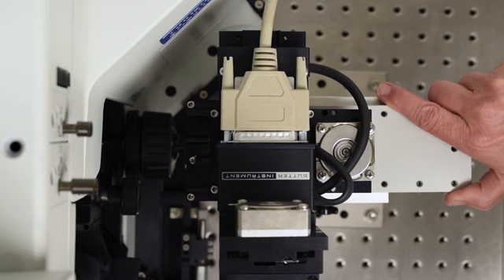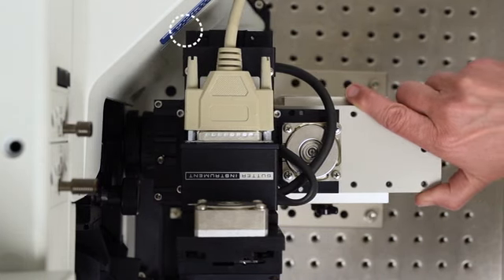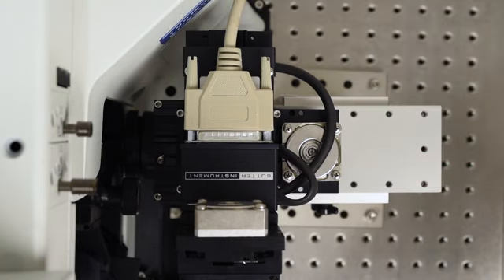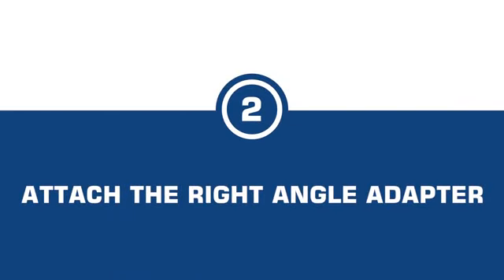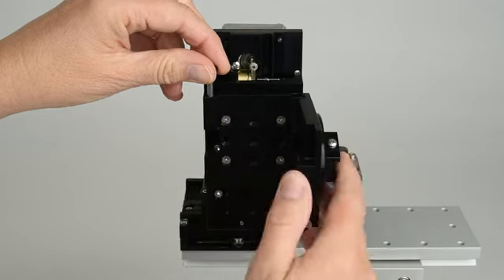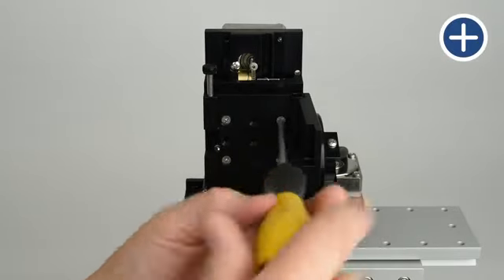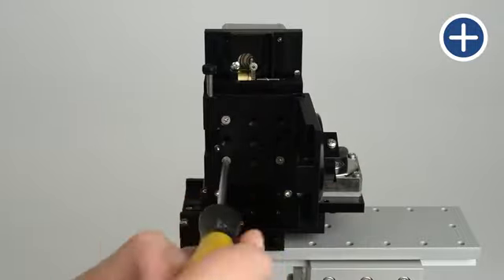In our example, you can see that when moving the manipulator in the x-axis, its path is obstructed by the wings of the microscope. In this case, the solution to this issue is to use our right angle adapter. First, remove the swing gate from the front of the manipulator by removing the 4 Phillips screws that attach the swing gate to the manipulator.